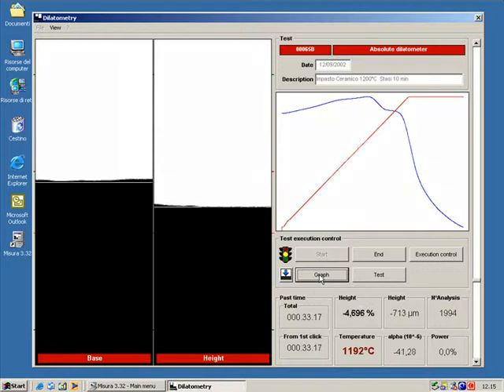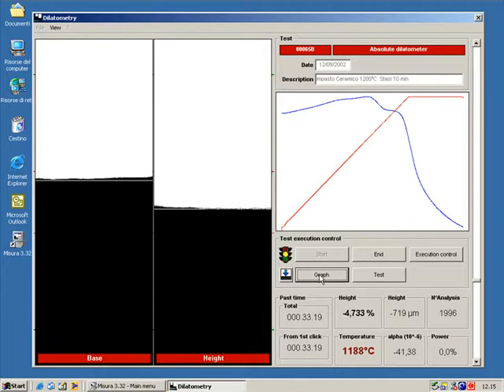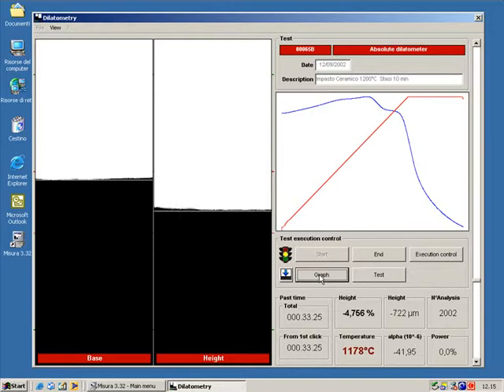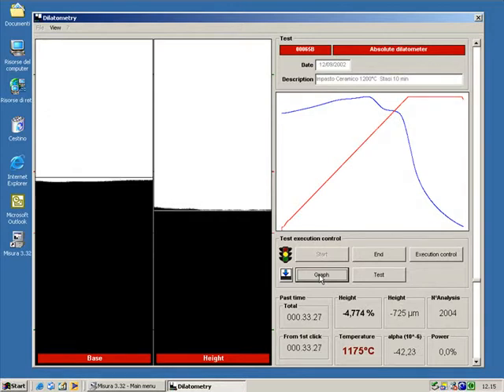At the end of the permanence at 1200 degrees, the cooling starts and the temperature drops very quickly. The height of the sample keeps reducing because of the thermal contraction caused by cooling.